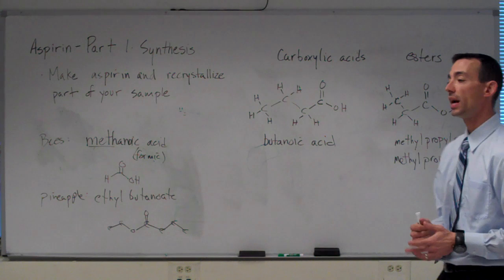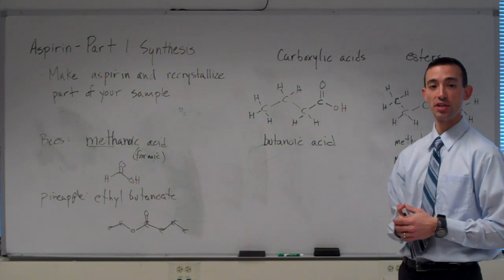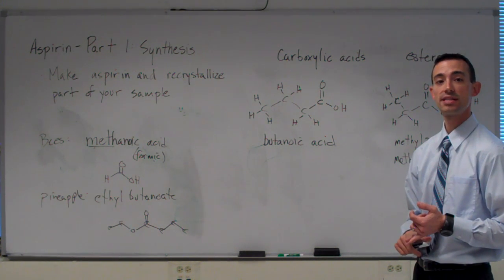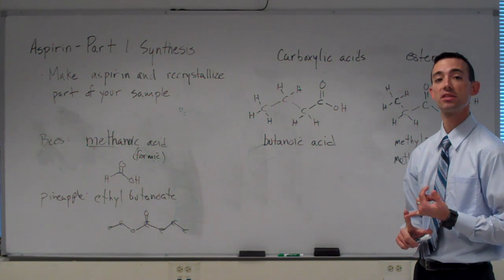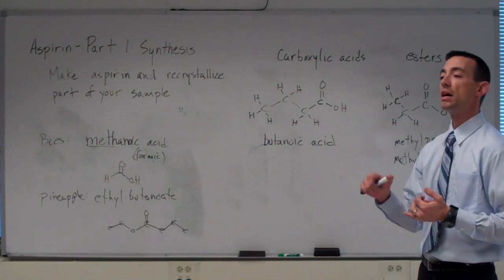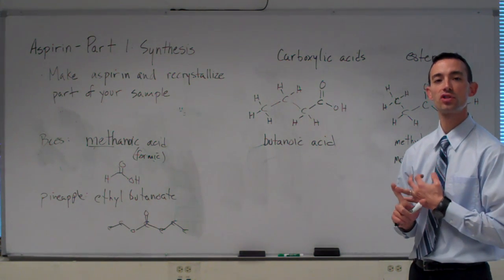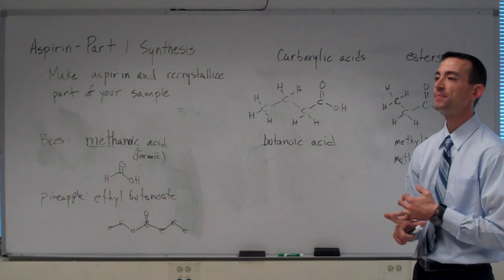I believe we've gone through everything that's necessary for discussion in the experimental procedure. Again, be sure to work in the fume hoods with your reactions set up. And for your filtration, you'll have to do that to have access to the vacuum systems. Careful handling the concentrated sulfuric acid. Gloves are probably a good idea during that portion of the experiment.